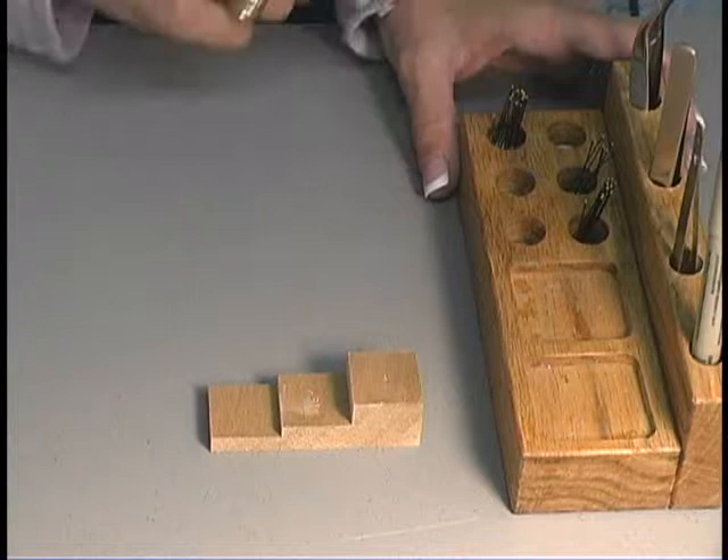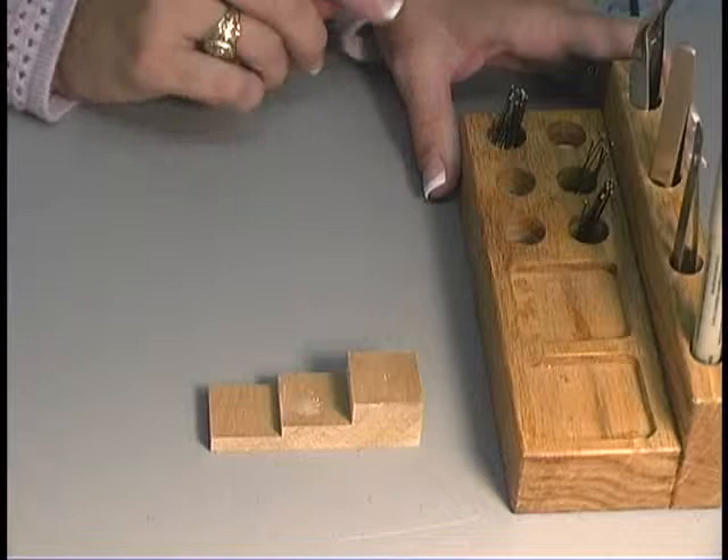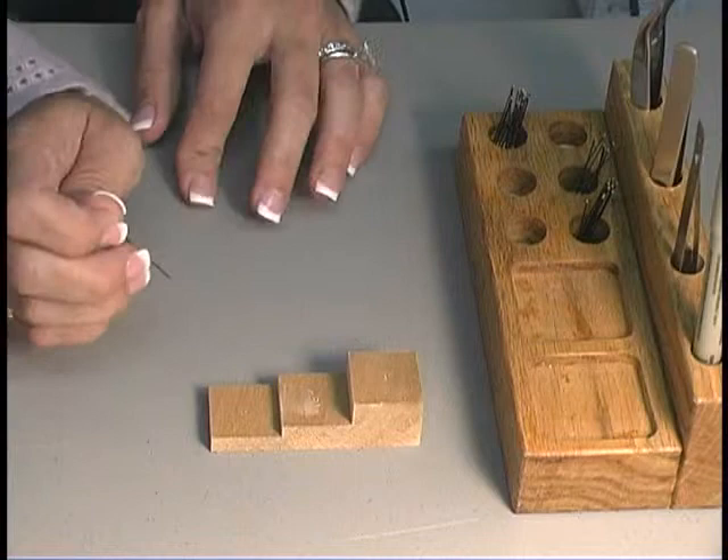Before we start pinning, we have to make sure that we do have the proper pins. We use insect pins — commonly we use size two or three. These will not rust and they're steel pins.